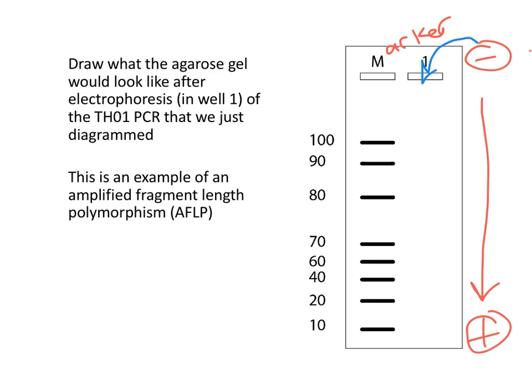DNA goes in the well, 10 microliters of sample, with a colored dye. So we add basically a navy blue dye that's also a charged molecule, so we can see where the DNA is as it moves through the gel. It doesn't stain the DNA, it just shows how migration is progressing through the gel once the electric field is applied. And where should our two molecules wind up?